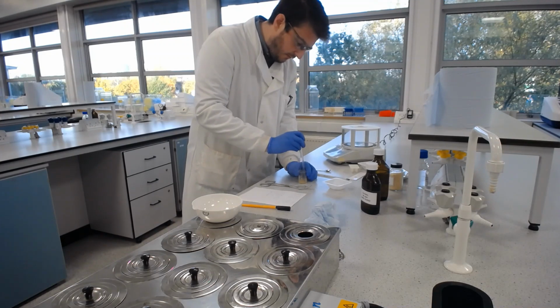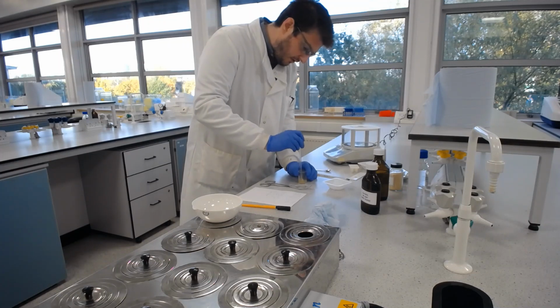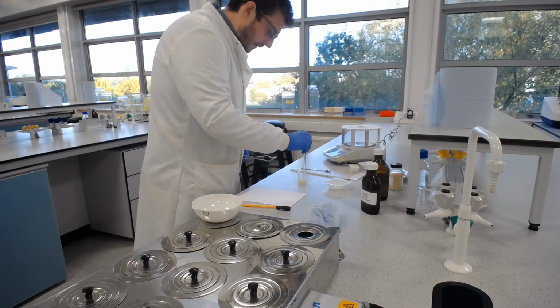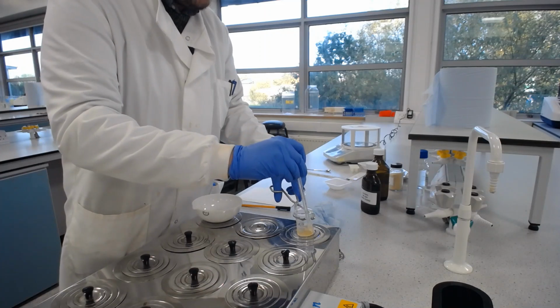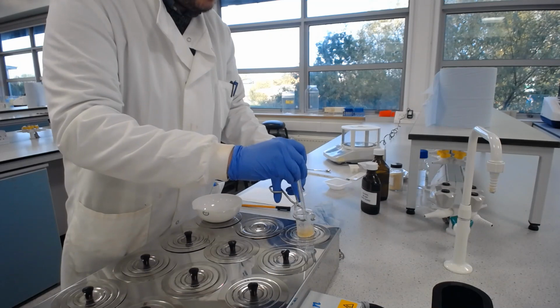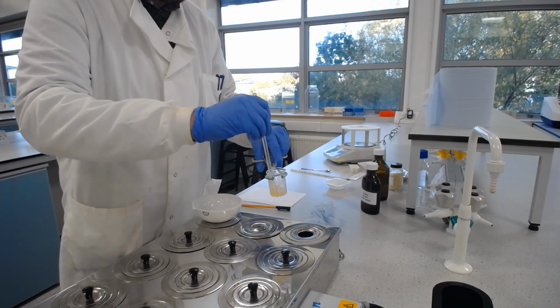You might have noticed that I very, very gingerly touched this beaker before I fully touched it. That's just because I was a bit worried that it might be too warm. So we don't want you to grab something that's too warm to grab. Now, what we can do at this stage, if it's cooling down too much, is with the tongs, put it back over the water bath and stir it with our glass rod. But we don't want to keep it on there for too long at any one time. Just until we have a nice homogeneous gelatin mixture.